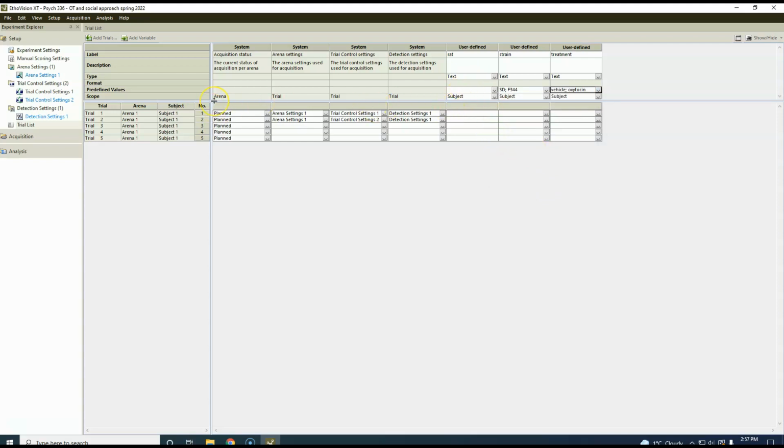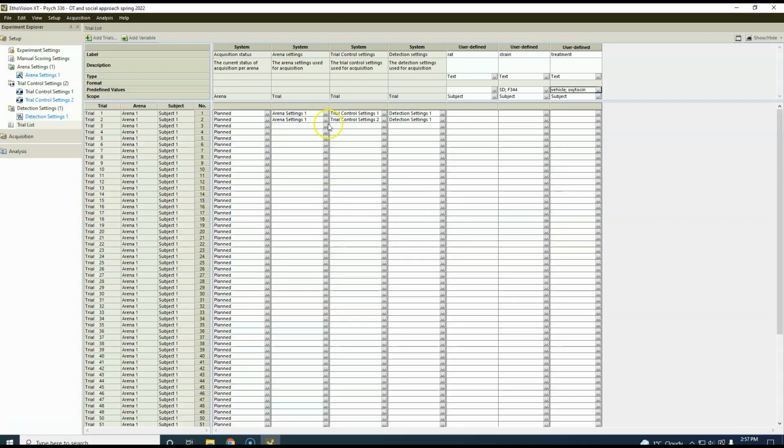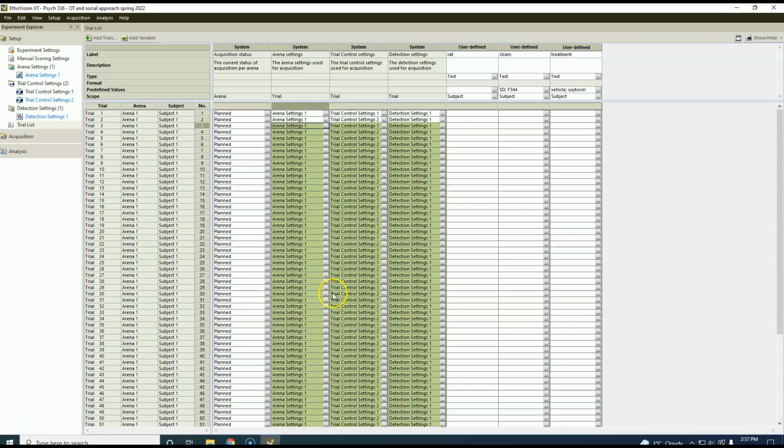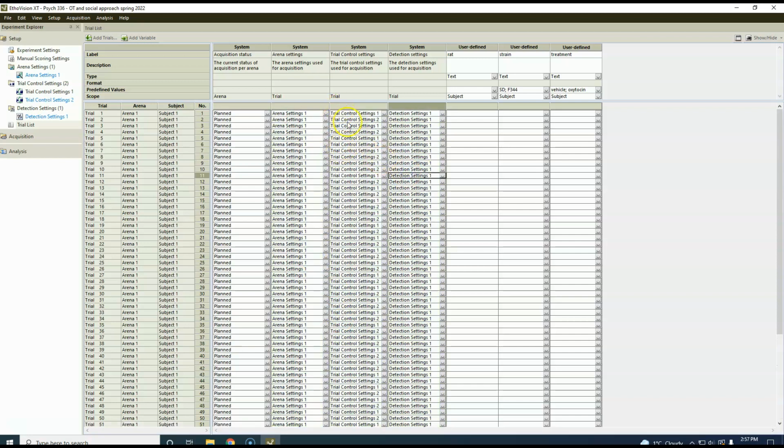Then we do that, and okay, and I'll be adding a bunch of these trials. We're going to have 32 rats, 64 trials. I'm going to do a couple extras. So if I add, I don't know, let's say 64, we'll do 64 trials, add them on, and that's it. Okay, so if I do this, copy, and take you all the way down to the end, I think, there we go. So I've set it up.